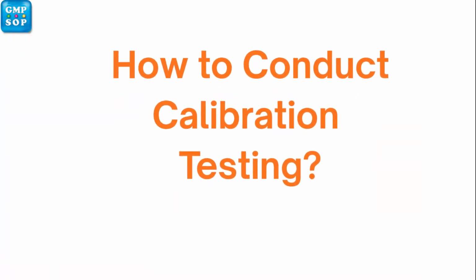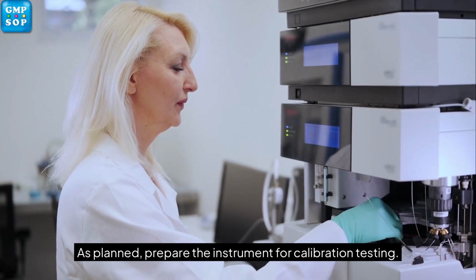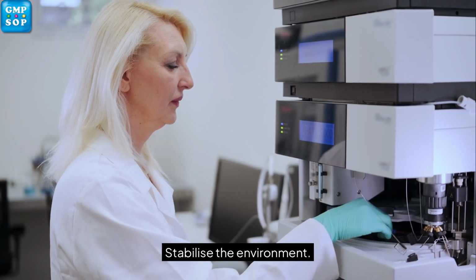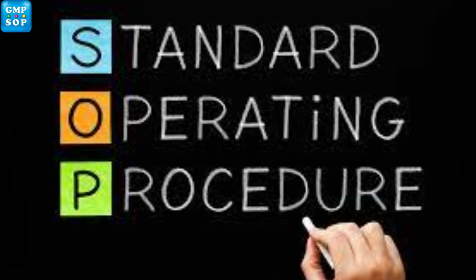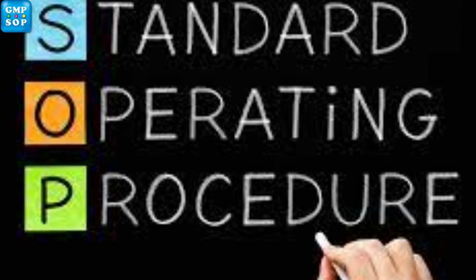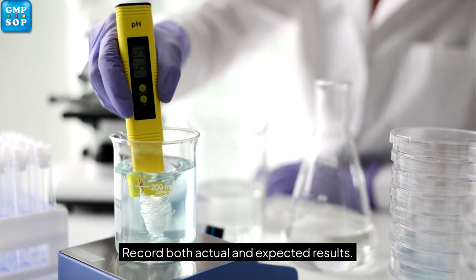How to conduct calibration testing? As planned, prepare the instrument for calibration testing: clean the instrument, stabilize the environment. Confirm reference standards are valid. Always use the SOP or manuals before performing the calibration. Compare results against the standard. Record both actual and expected results.